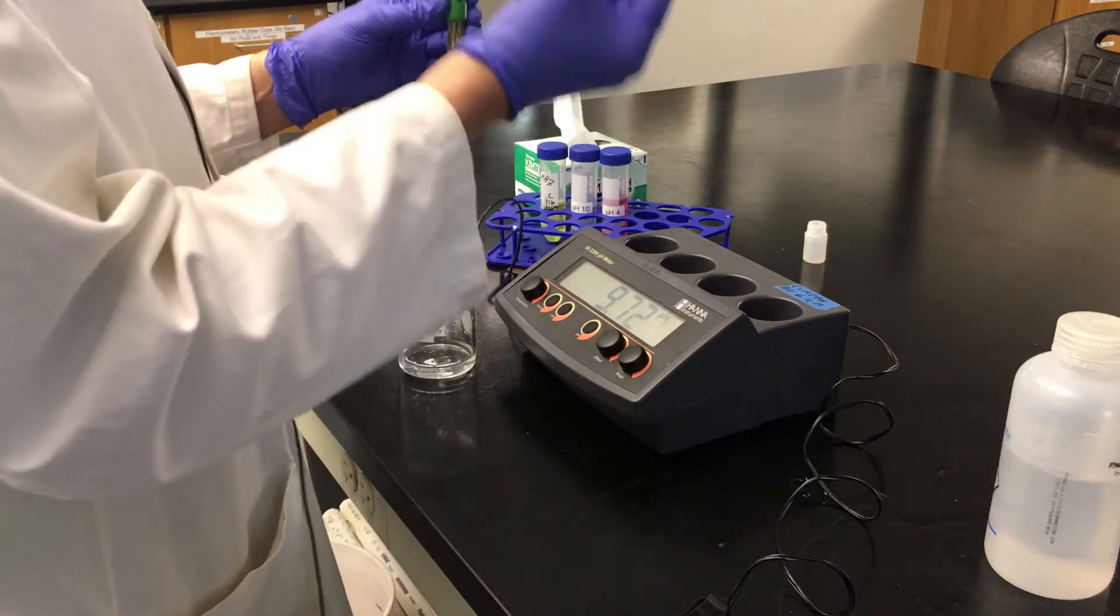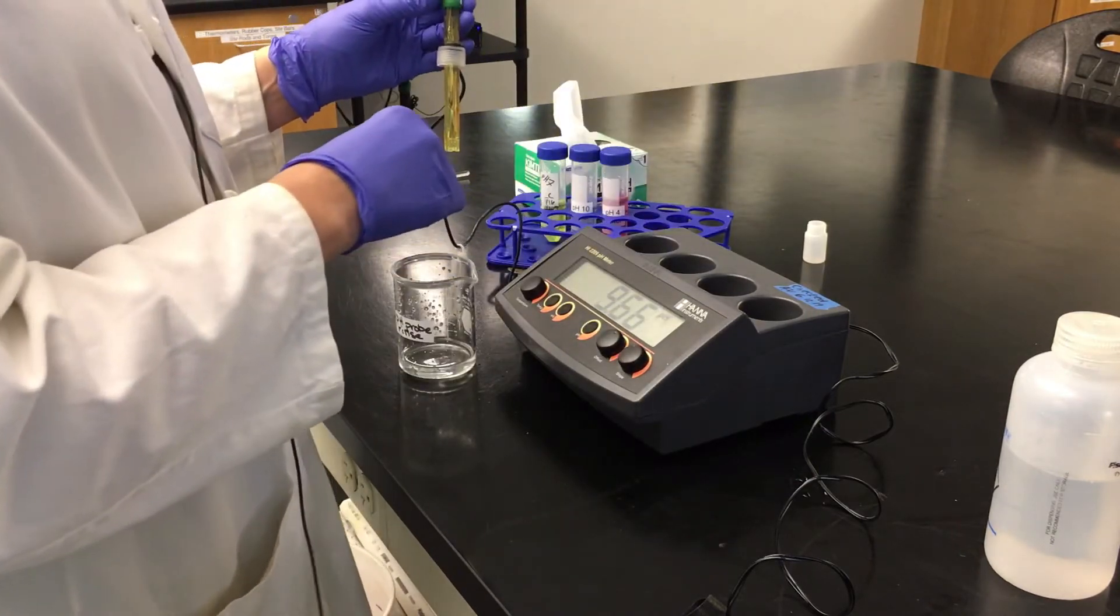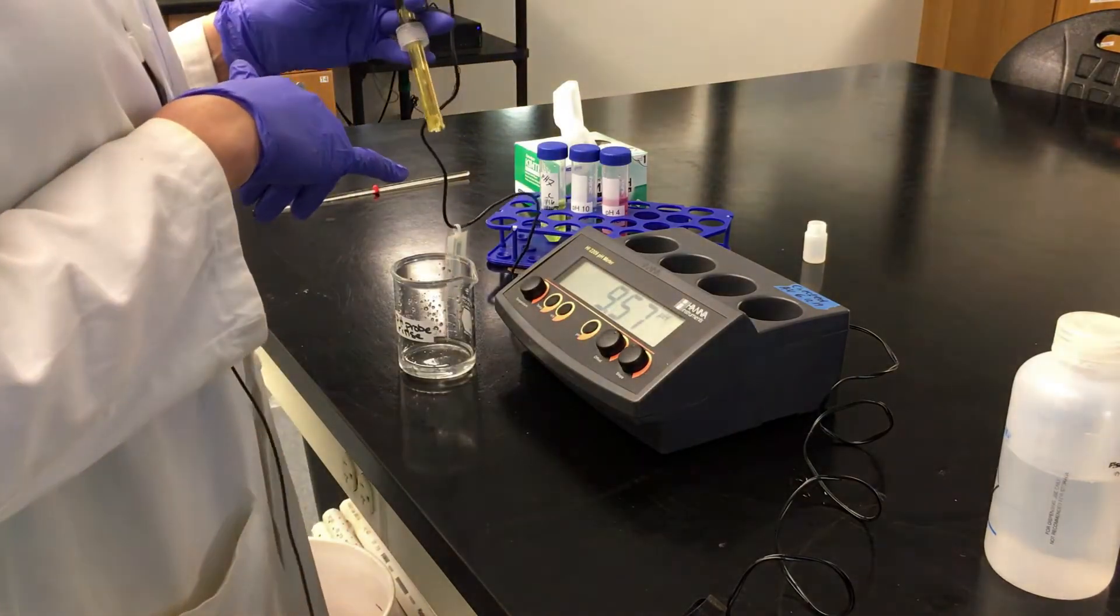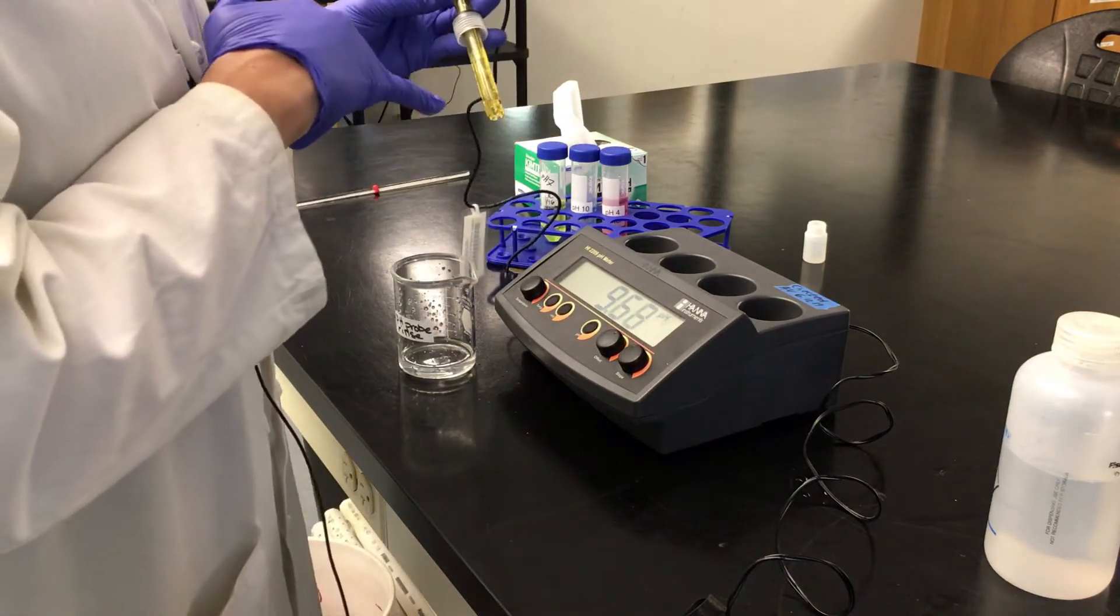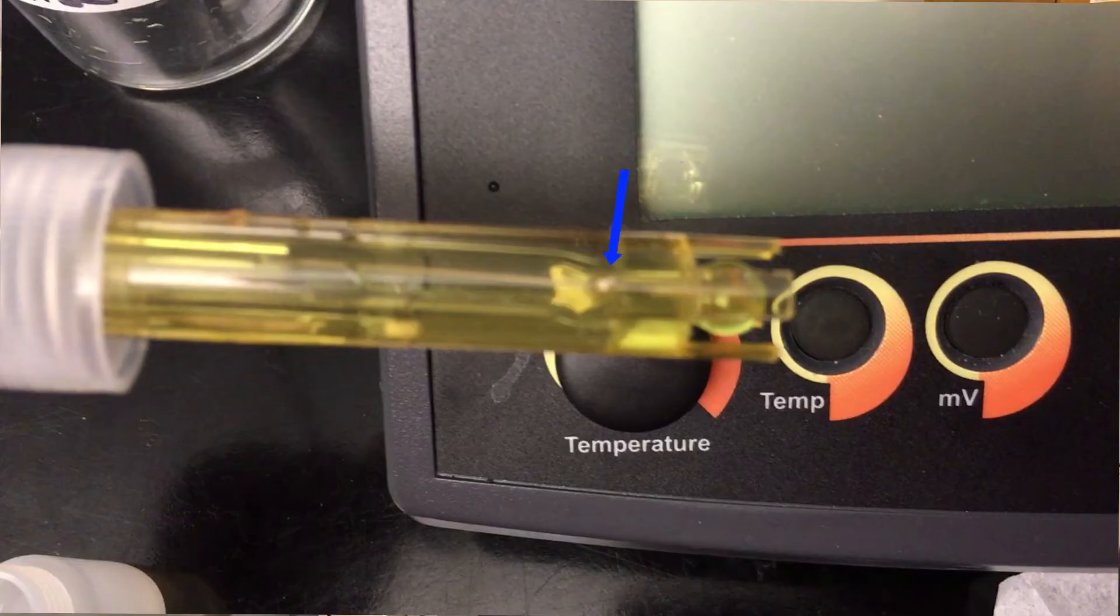Okay, so you're going to remove the cover there, or the cap. It just unscrews and set it aside. You do not want to lose that. And then make sure that any time you're taking a measurement, you want to make sure that this reference junction, there's like a little dot right down here, is completely submerged in the solution that you're reading.